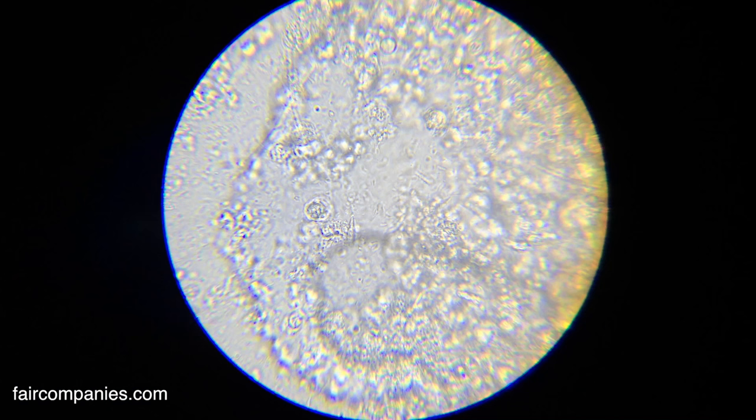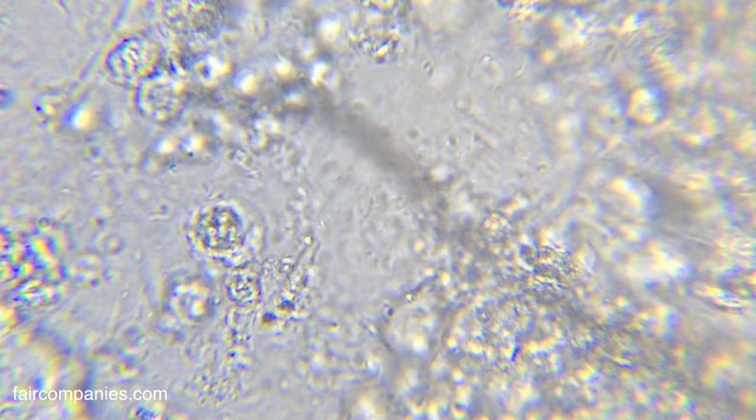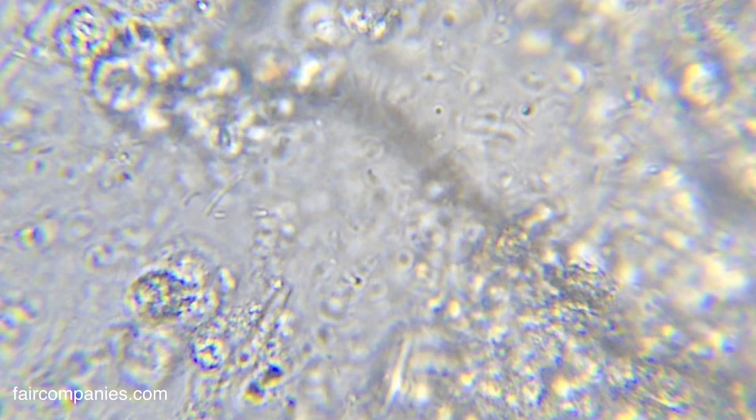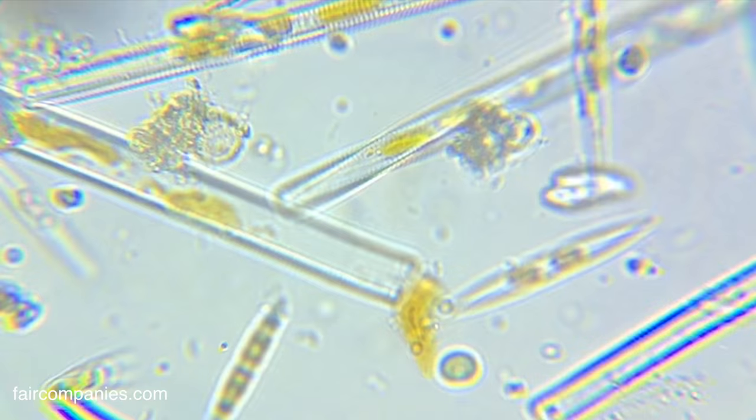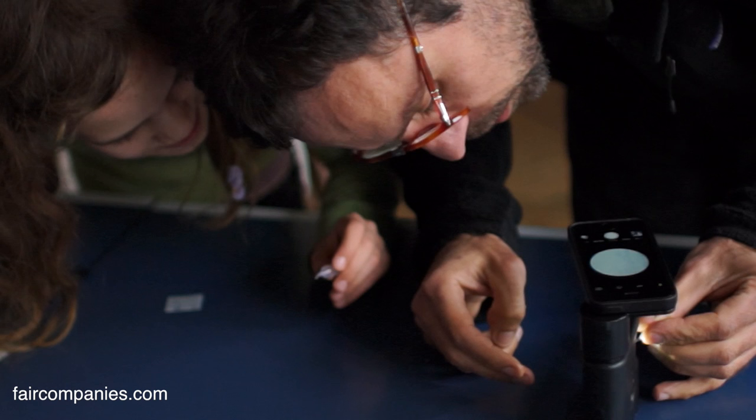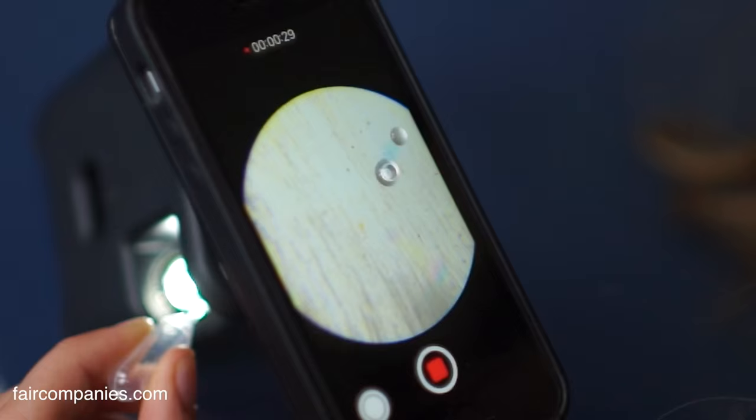Do you want some of my saliva? Not me! So now you can really see the bugs. Every organism, every multicellular organism, every plant, every animal, all the different multicellular organisms, they're covered also in a cloud of microbes. This is earwax. Really? Earwax? Ew!